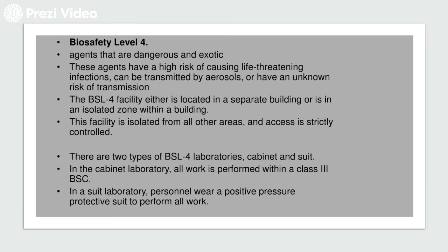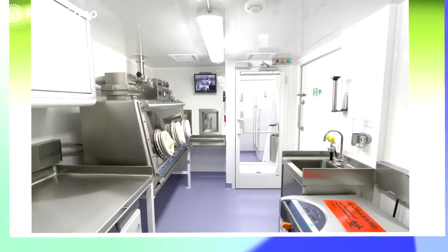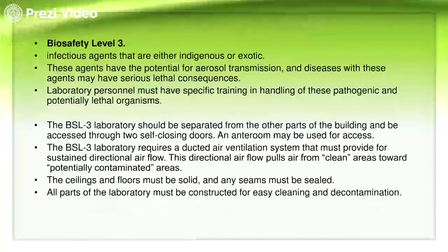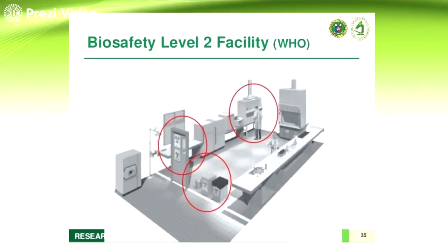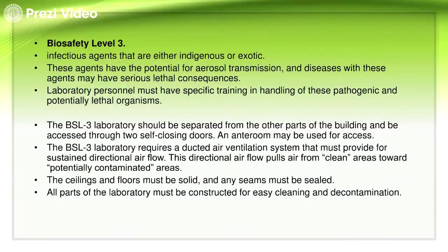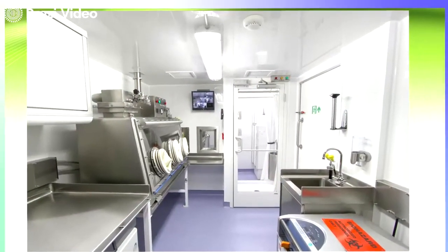So, in the cabinet laboratory, all work is being performed in a class 3 biosafety cabinet. So, kanina, kapag biosafety level 2, gumagamit ka na ng class 2 biosafety cabinet. Okay? However, pagdating mo sa biosafety level 3, gagamit ka na ng class 3. Doon din sa biosafety level 4.